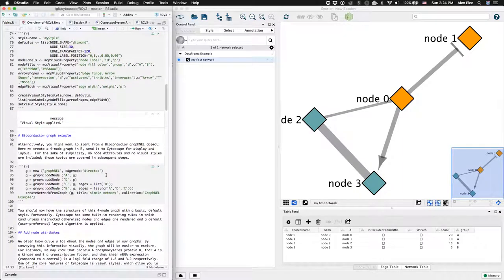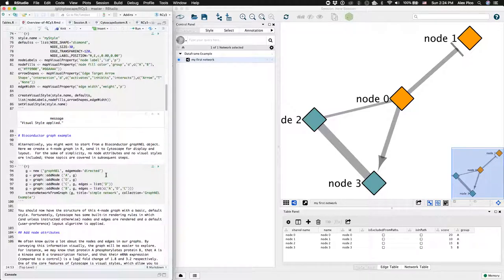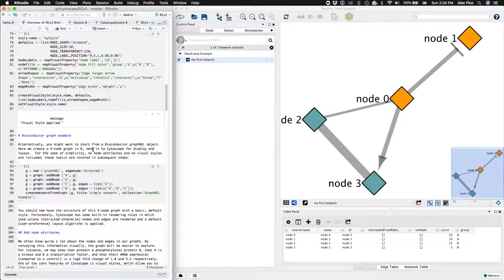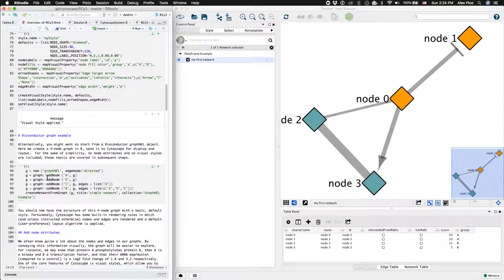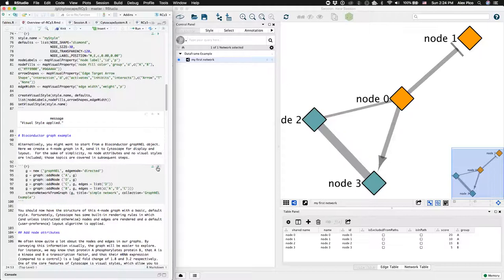Another common network type in R is the graphnel network object. This demonstrates the conversion of a graphnel object to Cytoscape, using the createNetworkFromGraph function.